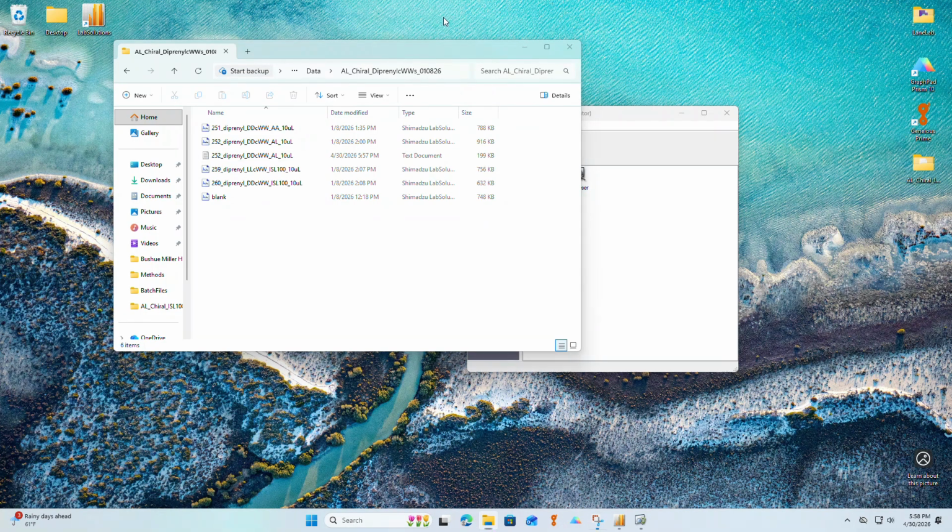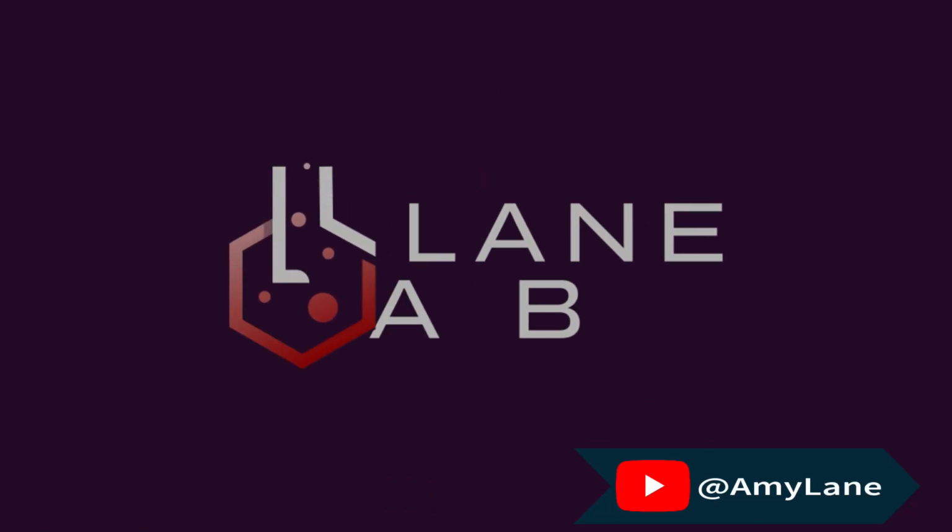And now at this point, you'd be good to take this file, drag it into Excel, or whatever other program you want to use it with.